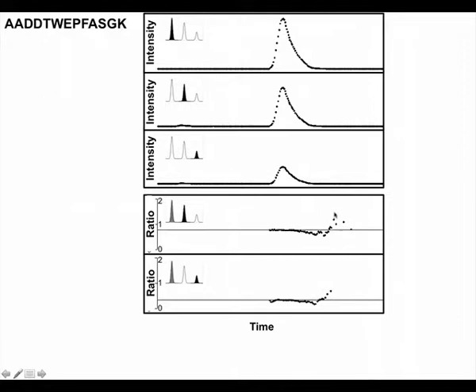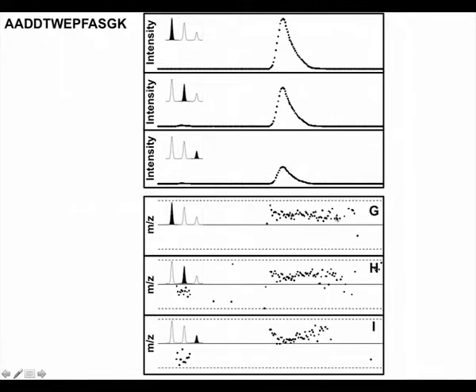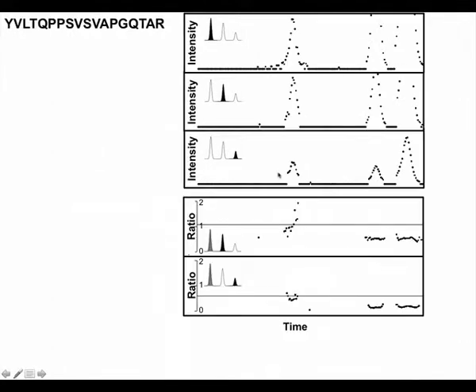But we're starting to get more variation there, of course. But as you see, there's very little. I mean, by eye at this linear range, we can't really see the peak anymore here. And also looking at the mass to charge ratio, we see that it's quite constant throughout the region. And this is what we can then use, both these ratios and the mass accuracy, to determine whether we have interference or not.